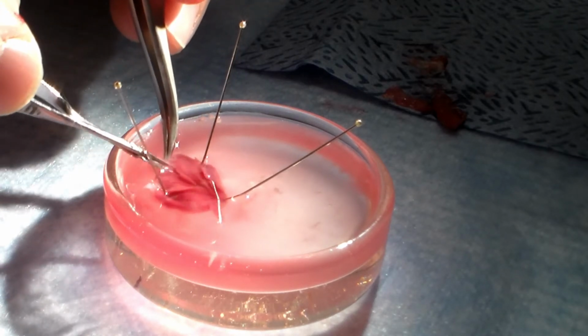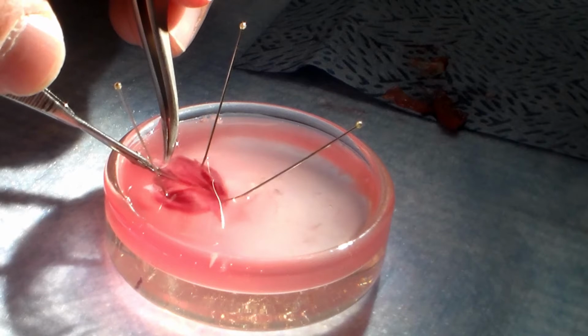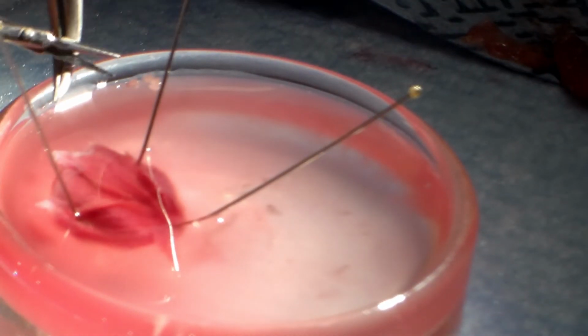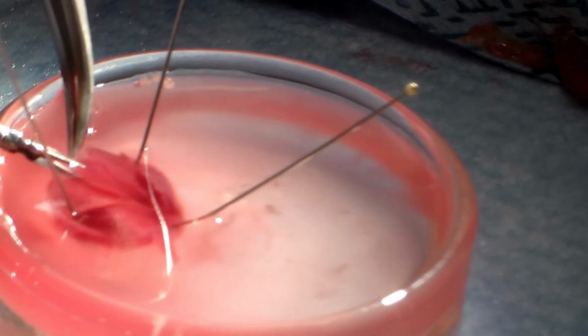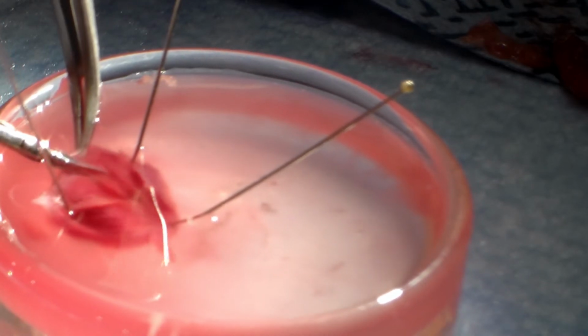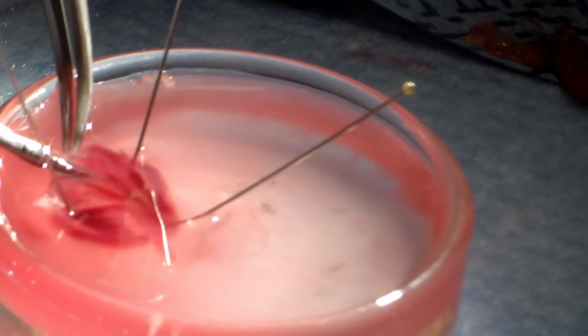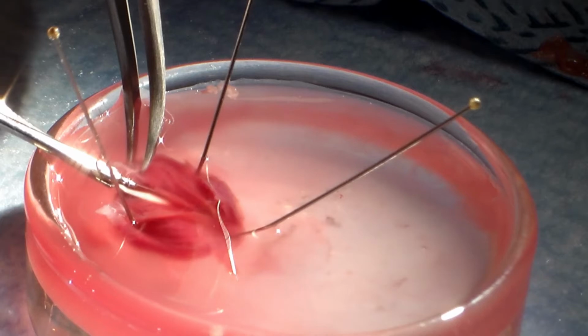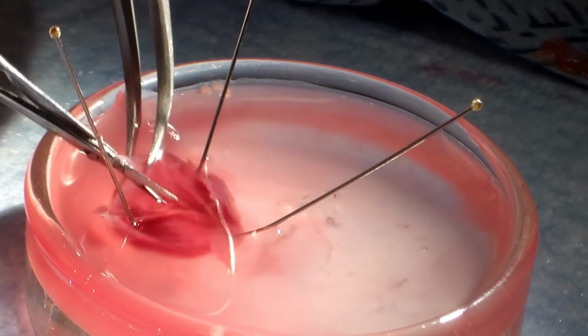The technician now cuts out the papillary muscles. This is usually done with a finer pair of scissors. It is very important not to hold the muscles with the forceps. Pinching or pulling the muscle will damage it and render it useless for later physiological analysis.